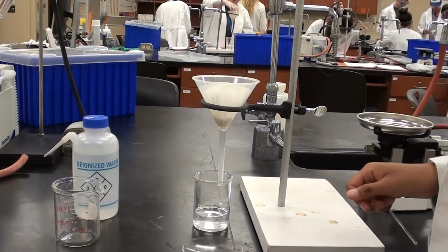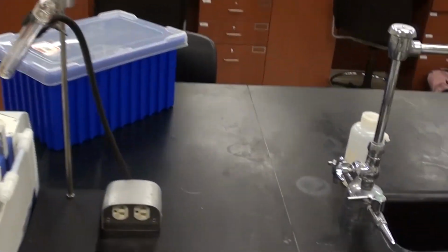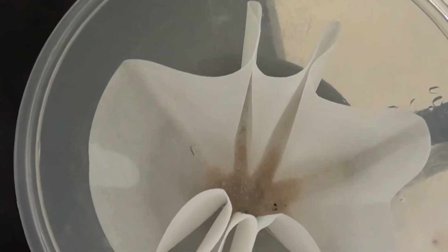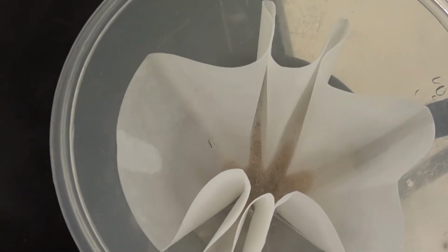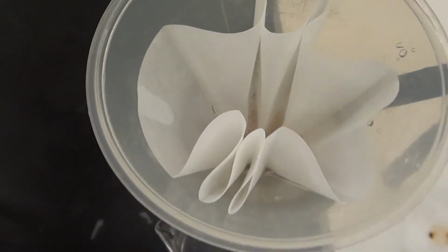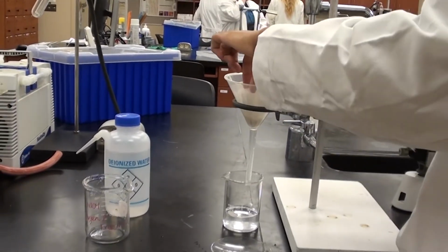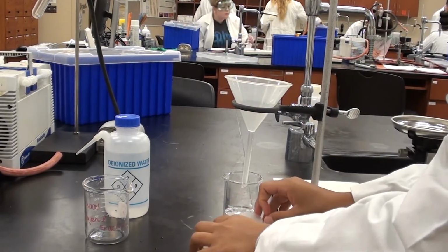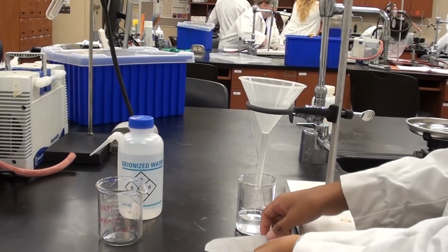Now, I'm actually going to show you what it looks like inside here. And what you can see is there's no water on top of the sand anymore. That's your signal that you can take it out and put it on the watch glass. Would you please do that, Sabrine? Take it out and then lay it on the watch glass. There we go. All right, let's take a quick look at that, please.